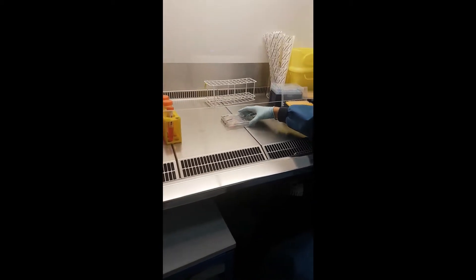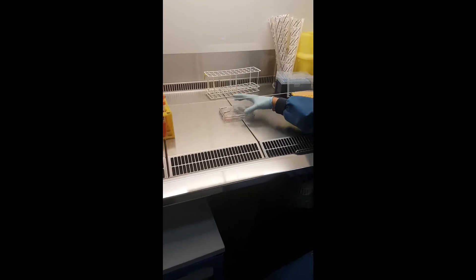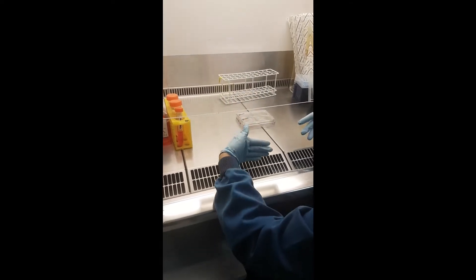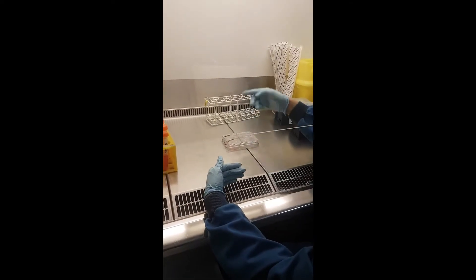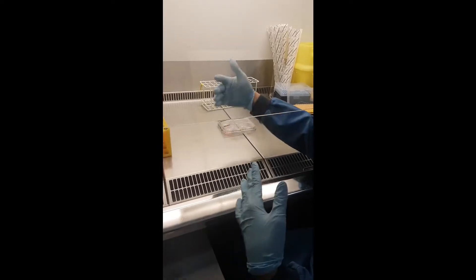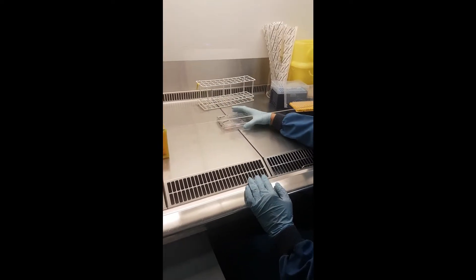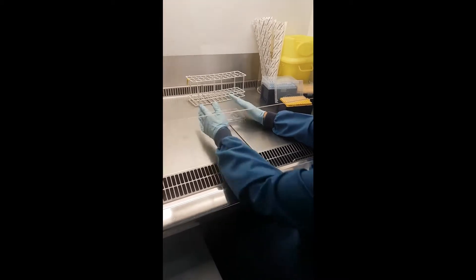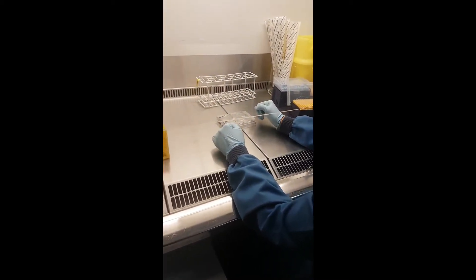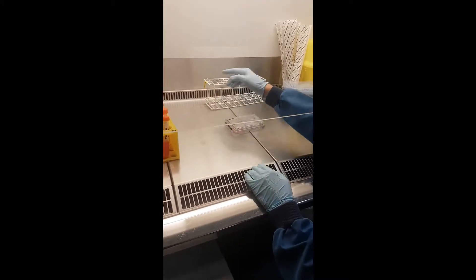When you work in the hood, try to keep the plate quite central — that's better because here the air still goes through in a circulation. You still have the risk of a mixture where the airflow from here meets the clean air, so make sure all handling is done in the clean air zone.